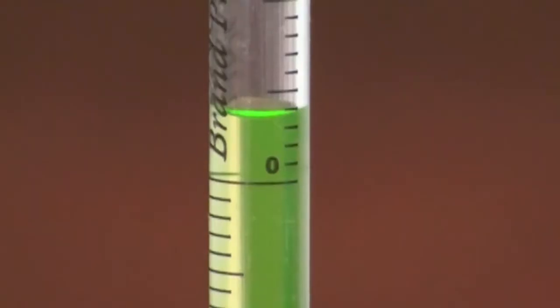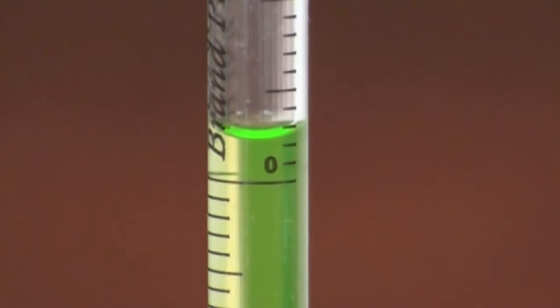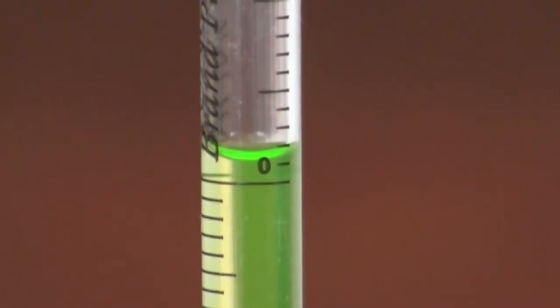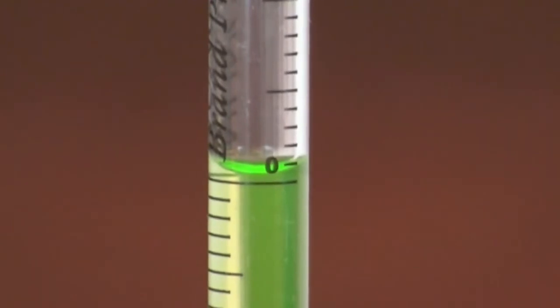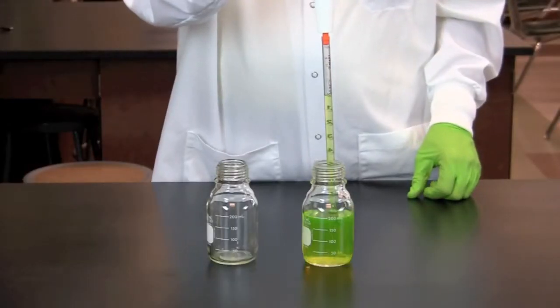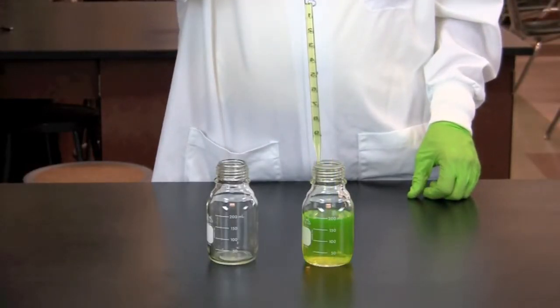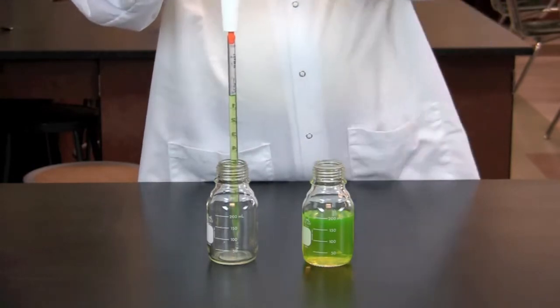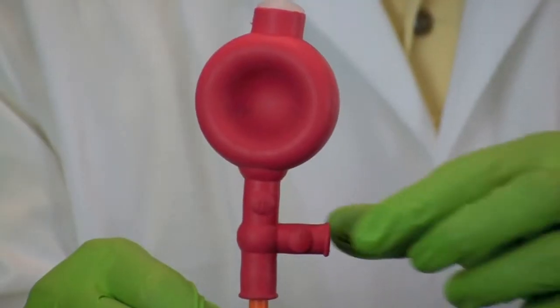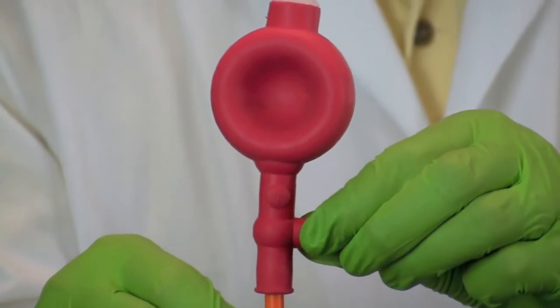Then gently squeeze on the E or exhaust valve until the bottom of the meniscus touches the desired graduated line. Move to the target container you wish to transfer the sample into. Squeeze the E or exhaust valve to dispense the solution.